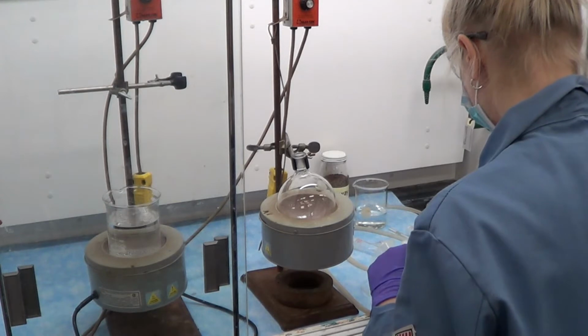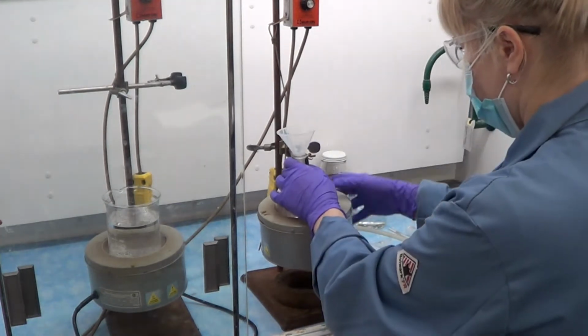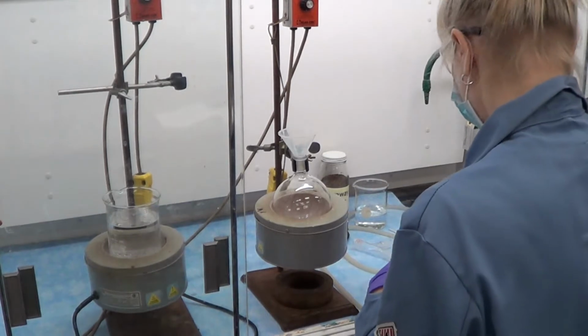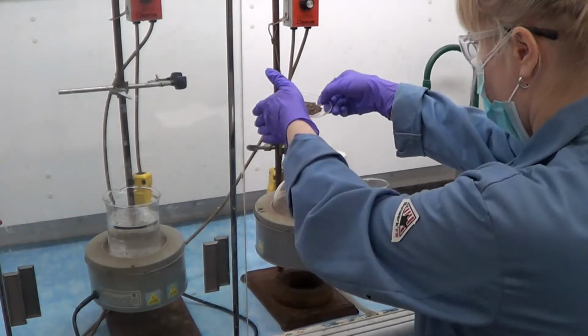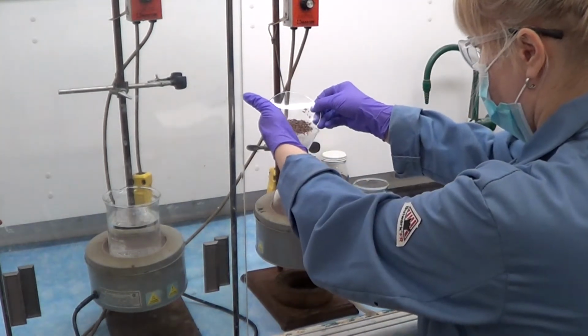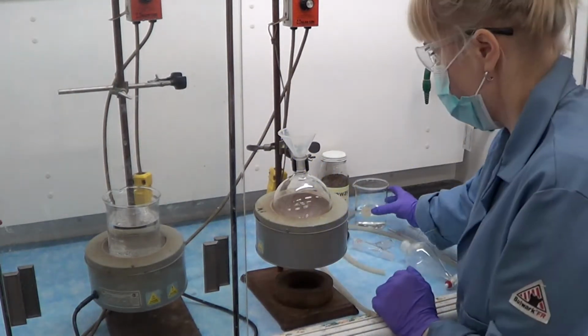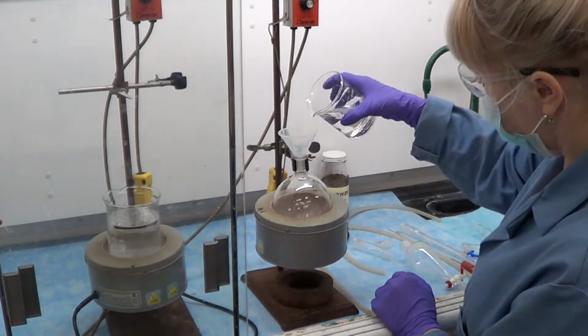Before starting, protective equipment such as safe lab attire, goggles, and gloves are mandatory. Water is to be heated on the side. This will be used later in the experiment. A large round bottom flask is clamped to the ring stand. About 5 grams of caraway seeds is added to the flask, followed by water.